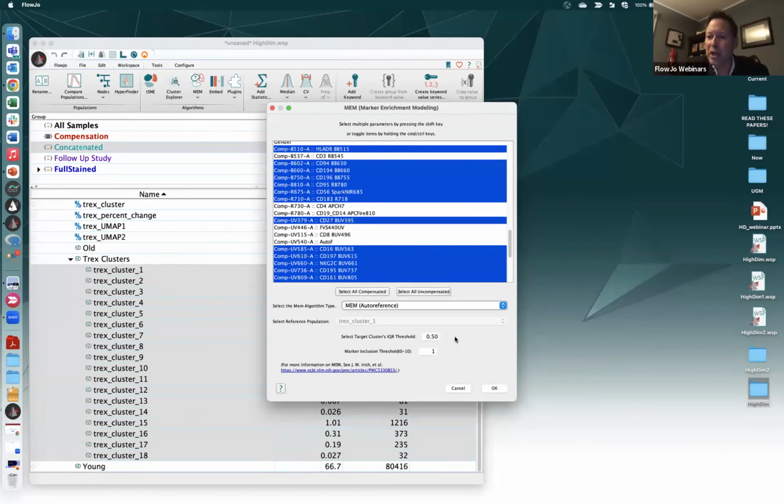So repeats and replicates are good for being able to turn something like a fold increase statistic into a confidence or a probability.